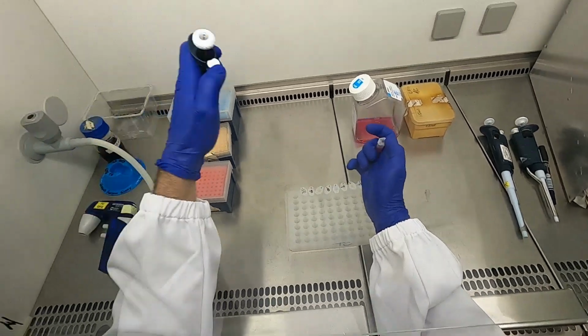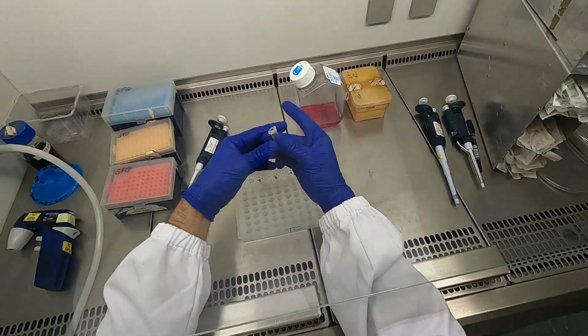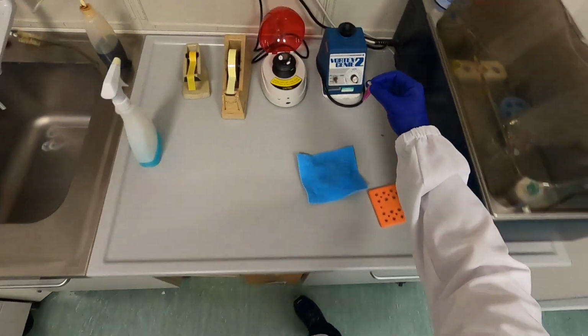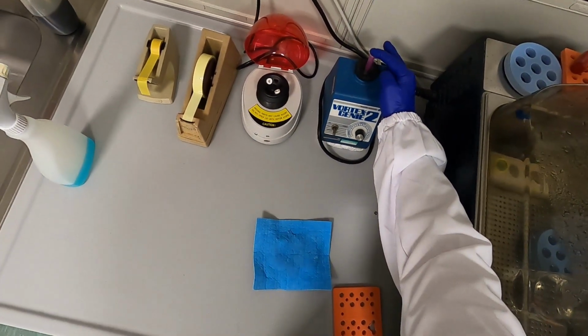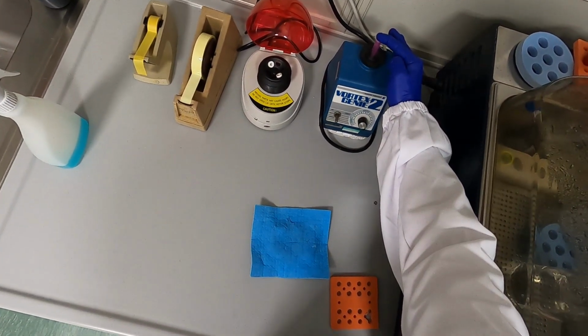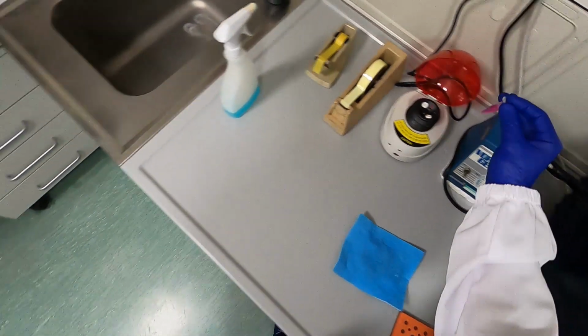And then it's a matter of just mixing very well. And the vortex does a great job at that. Inside the tube you can see like a little mini tornado if you're doing it well. It's very rigorous mixing.